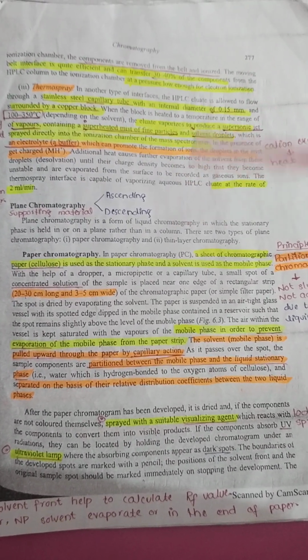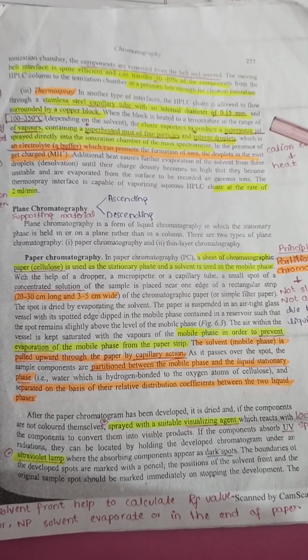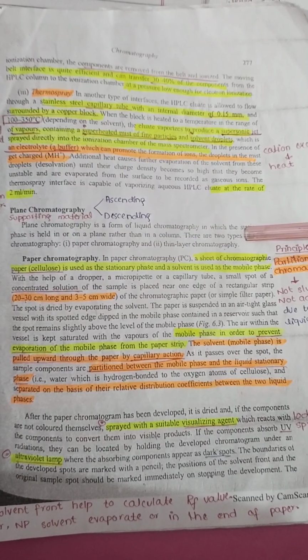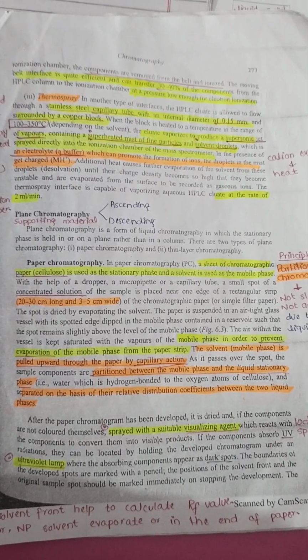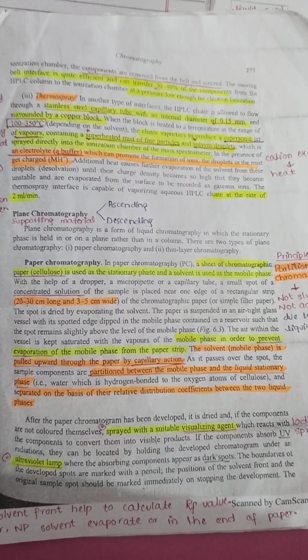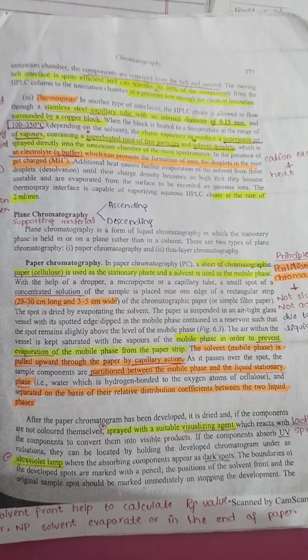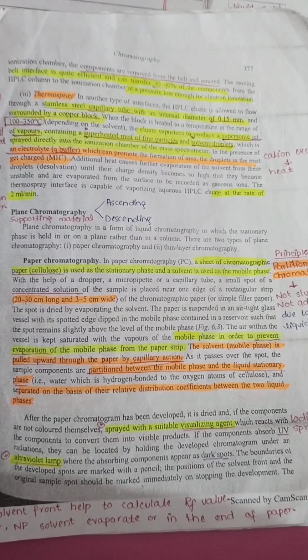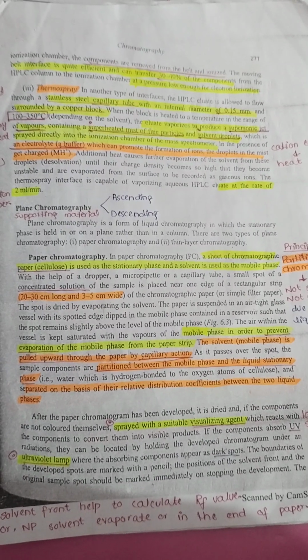There are different types of planar chromatography. Planar means on a flat surface. For example, we say paper chromatography or thin layer chromatography. In paper chromatography, a piece of paper is used as a support. In thin layer chromatography, we use a glass or plastic plate on which we apply a stationary phase, and it is used for chromatography rather than a column.